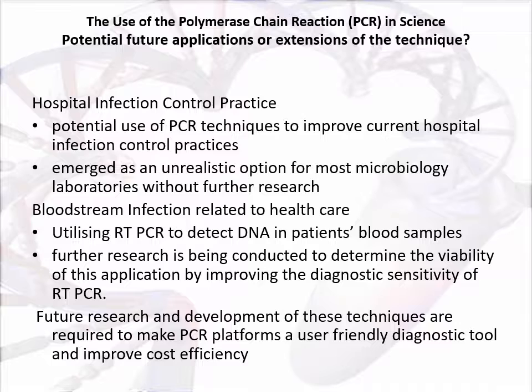Relating to the actual polymerase chain reaction techniques, at present they remain expensive and technologically advanced. Future research and development of these techniques are required to make the polymerase chain reaction platforms a user-friendly diagnostic tool and improve the cost efficiency, especially for companies, in particular the rural setting hospital facilities. In conjunction with this research, polymerase chain reaction protocols require standardization and improvement in their efficiency.